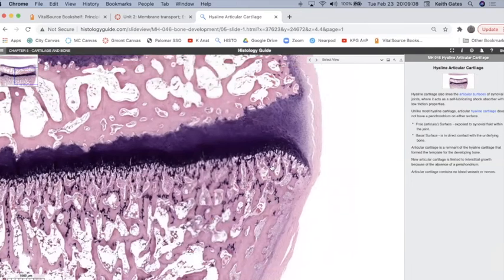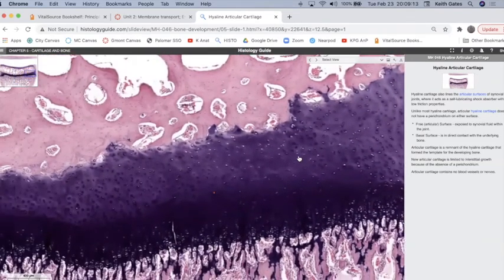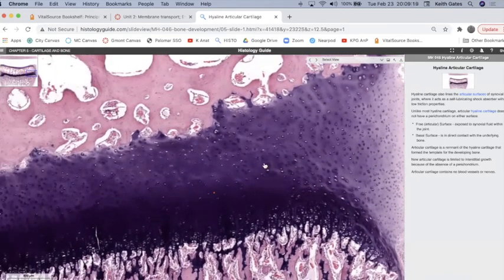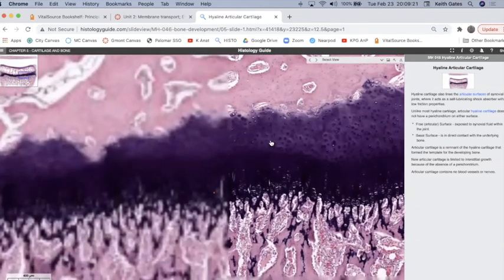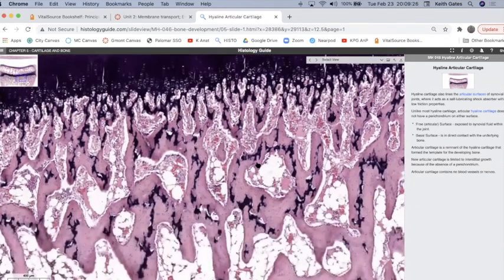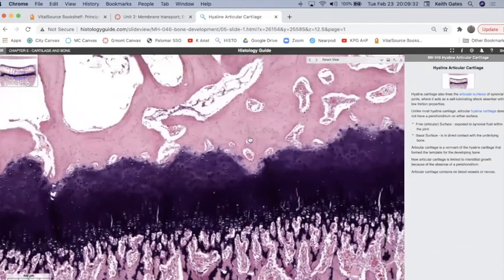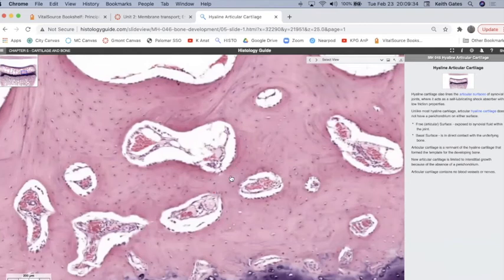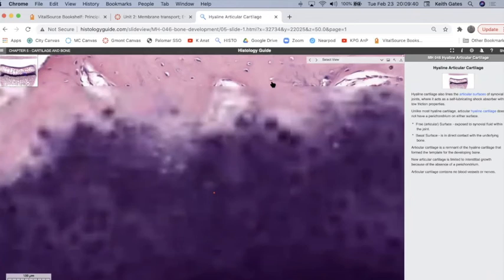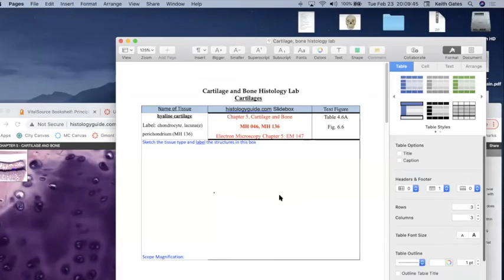Right, so you won't see any perichondrium here. This is really all periosteum on the outside. But you could tell the difference between the cartilage tissue and the bone tissue down over here, right? If nothing else, by the staining. But you'd also notice that within the bone, here's the little cells in the lacuna, here's all those blood vessels. When you get down to the cartilage, it's completely avascular, no blood vessels going through.